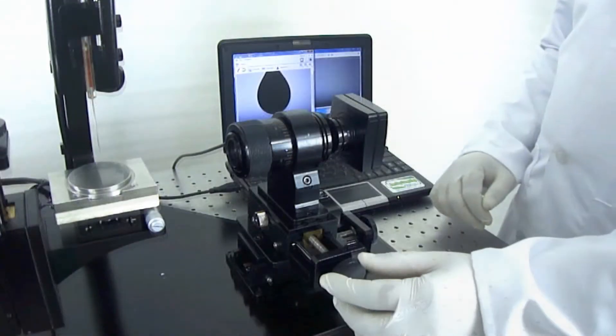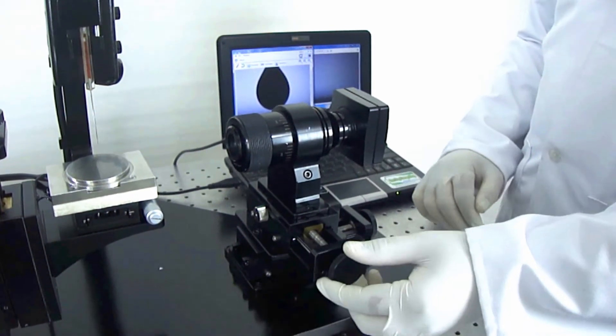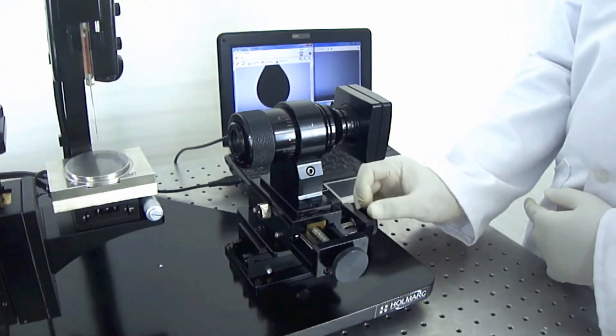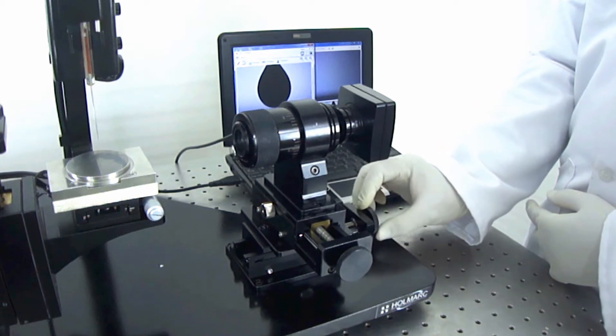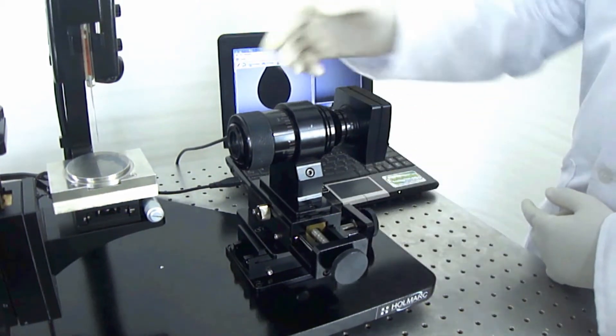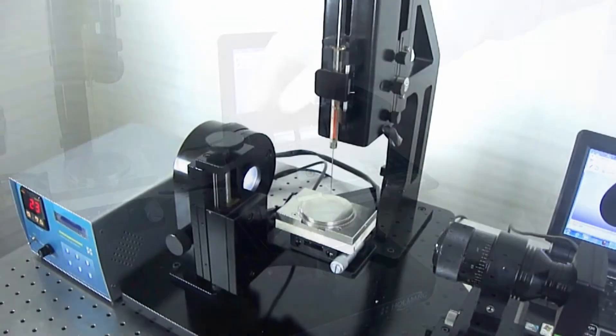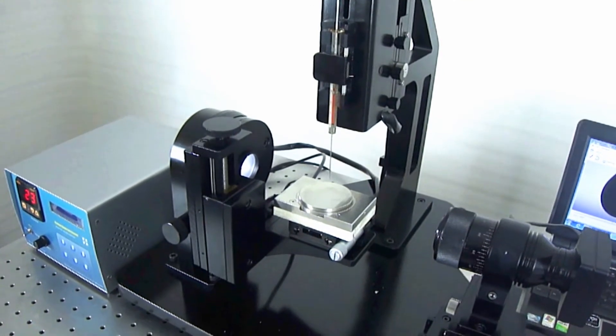Coming to the imaging part, the camera mount is provided with XY travel for fine focusing and centering the droplet on the sensor. The camera module is also equipped with a zoom lens assembly for optimal image capturing.